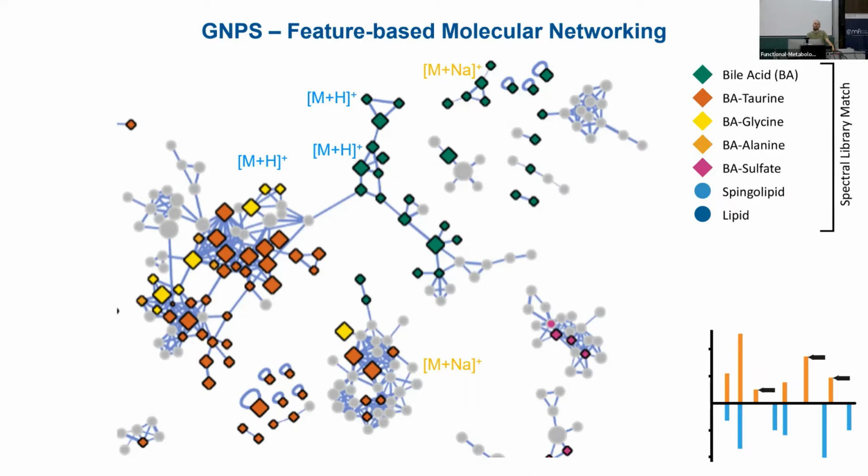I understood yesterday that MZmine is taking the peak area, right? Not the peak height, which sometimes is called peak intensity. Is it also possible to pick peak height in MZmine? Yeah. Personally, I very often use the peak height, because usually you have very narrow peaks and they don't vary between the compounds that you measure. Of course, everyone knows some compounds, even though they come at the same retention time, are more sticky and have a weird shape. Then area is better, but usually if it's all very narrow, I use the height.